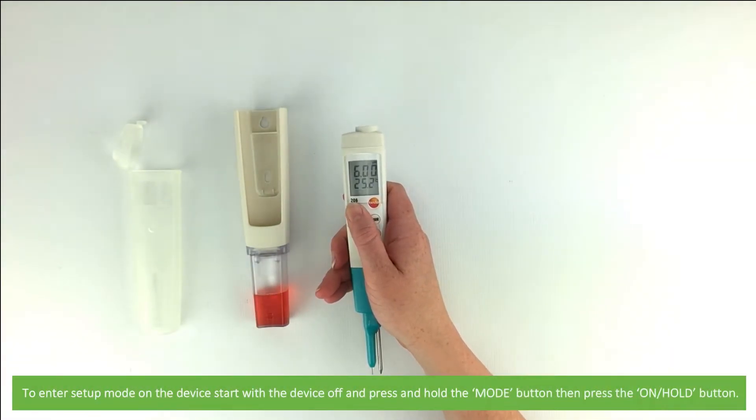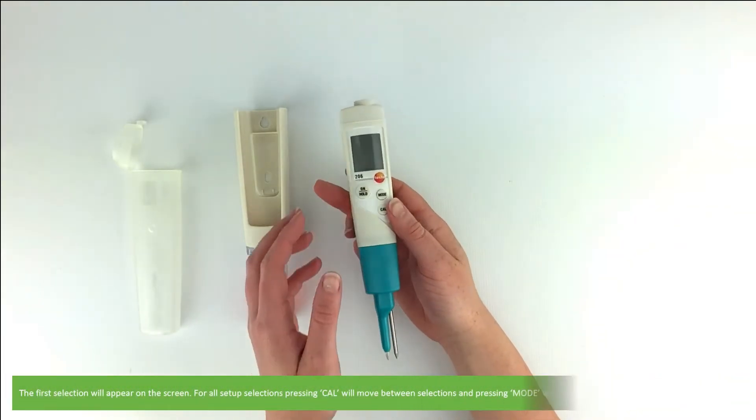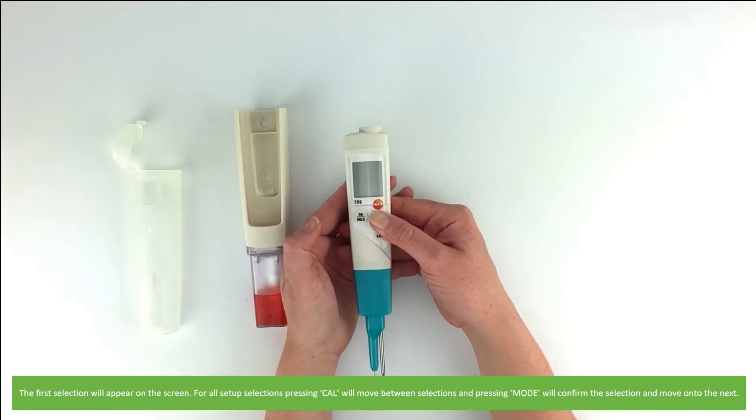To enter setup mode on the device, start with the device off and press and hold the mode button, then press the on button. The first selection will appear on the screen. For all setup selections, pressing cal will move between selections and pressing mode will confirm the selection and move on to the next.